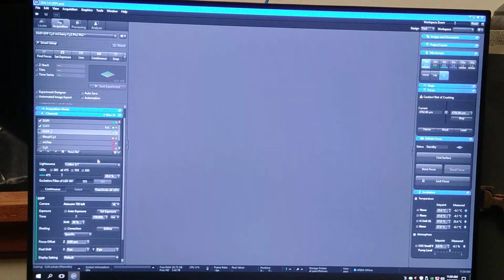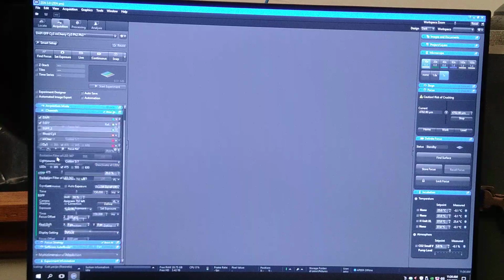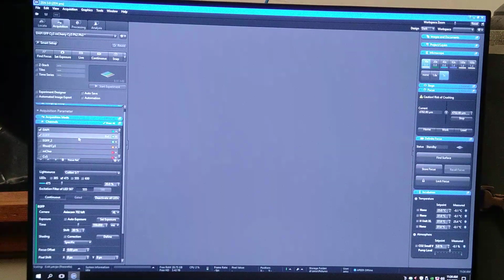All right, and so I'll have those selected. The reference is going to be what you want the focus to reference.